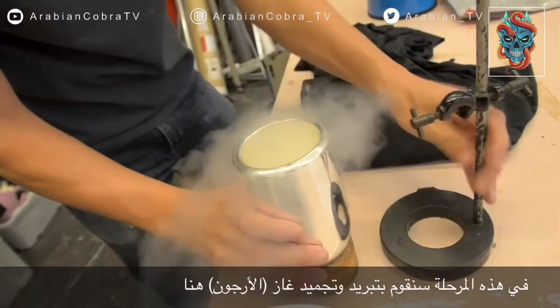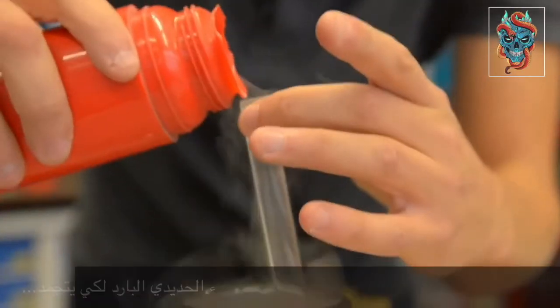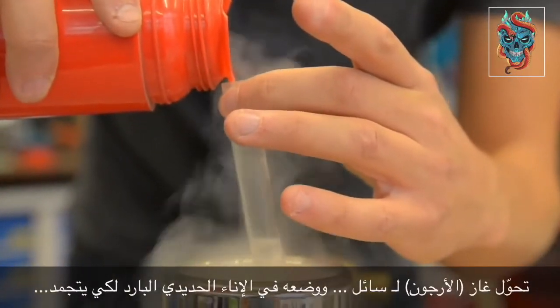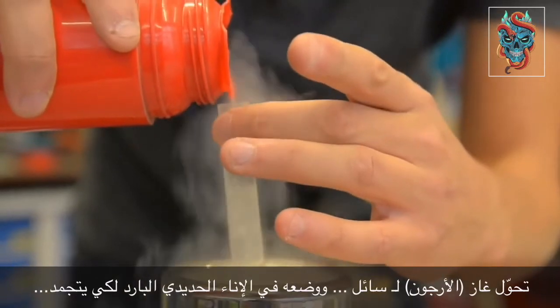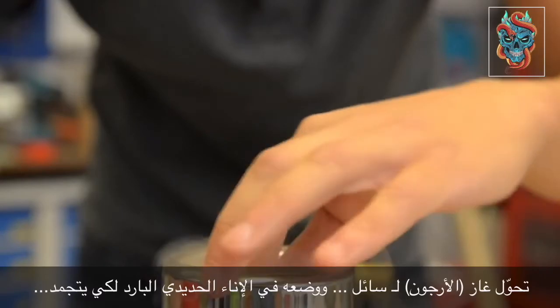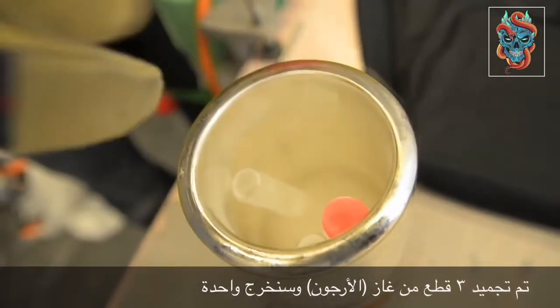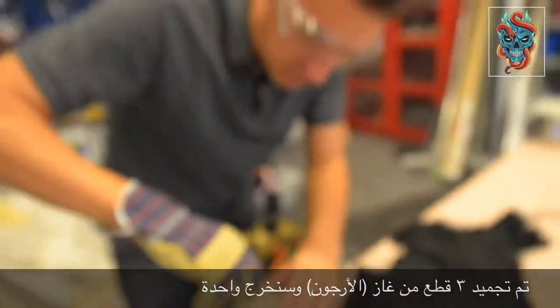The next stage: I'm going to freeze the argon in here. This is probably the point where I might start to need a glove. I've frozen three lumps of argon in here, so we'll take one out and see what we can see.